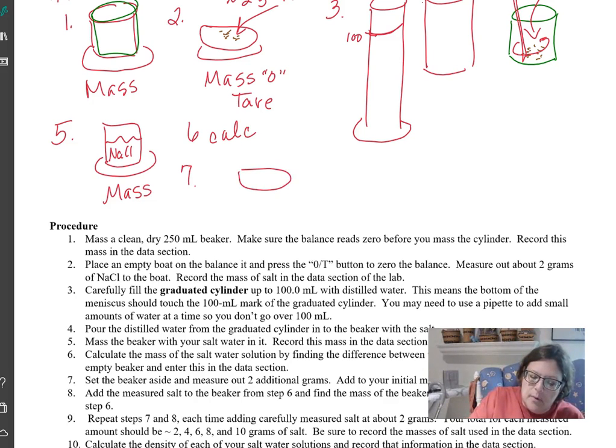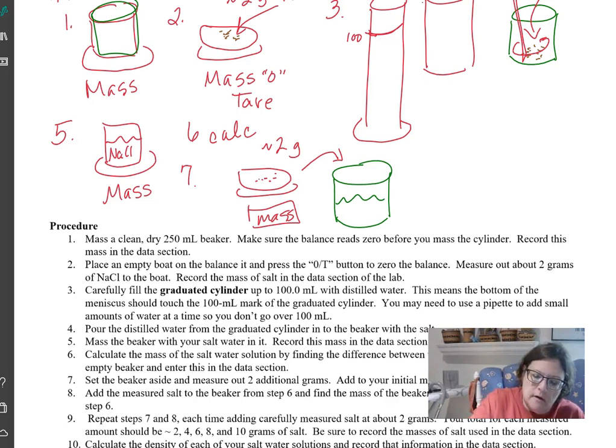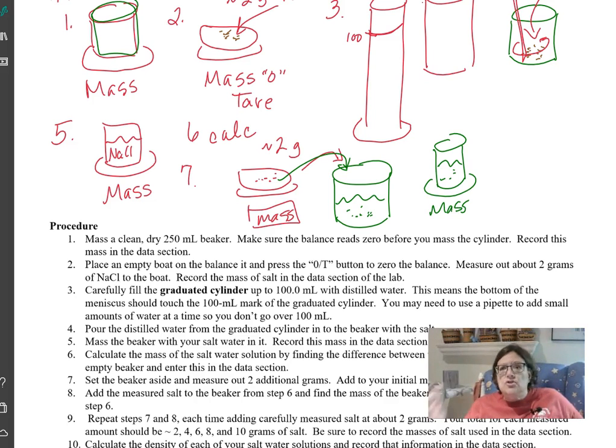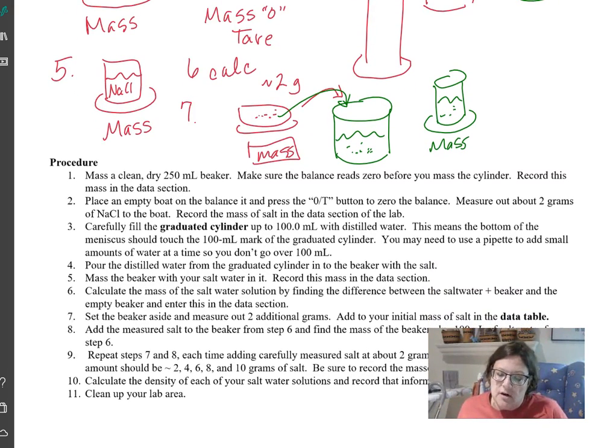7, we're going to have our boat, should be brown, but oh well. So you're going to add that into your beaker, which we changed to a green color. And now you're going to have 4 grams of salt. And that then will find the mass of that. So each time you're just adding 2 grams. Instead of doing 2 grams and dumping it and 4 grams and dumping it, we're just going to add a little each time. Okay? Set the beaker aside and measure out 2 additional grams.